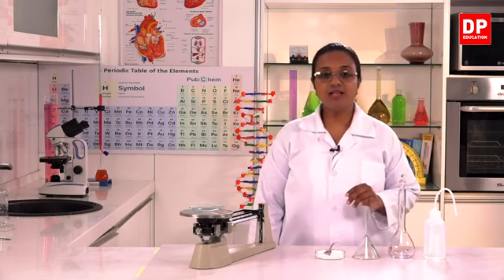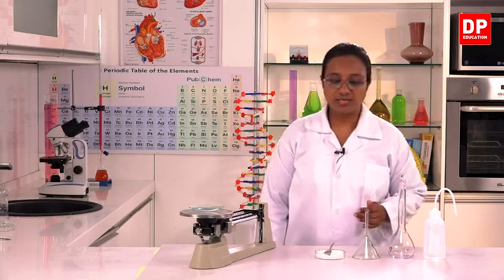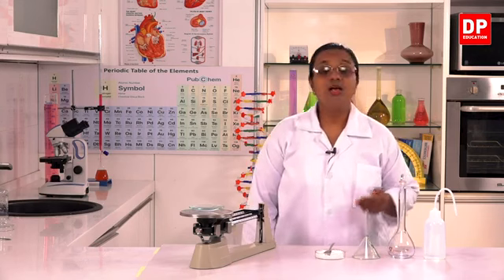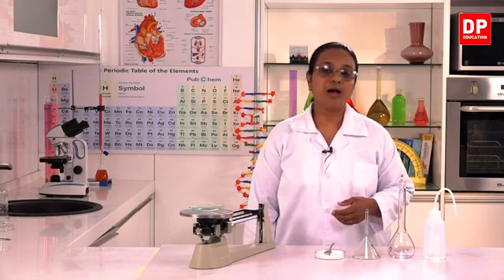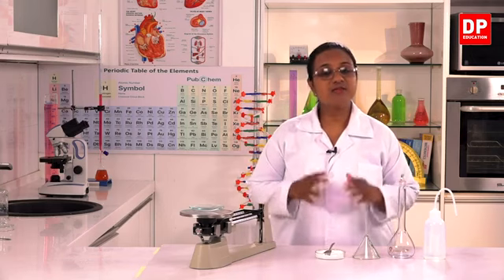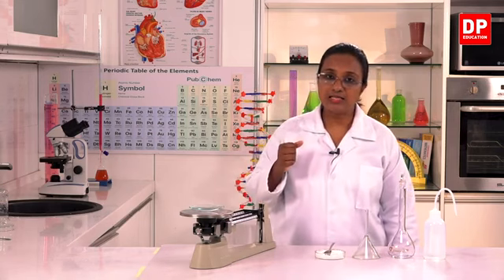Then I have the funnel to help us to transfer the solute into the volumetric flask, and also the solute is sodium chloride. We need to take 14.6 grams of sodium chloride in order to prepare 250 centimeter cubes of 1 mole per decimeter cube solution of sodium chloride. And as you know, students, we have to weigh the solute accurately. So to do that, I have the triple beam balance here.